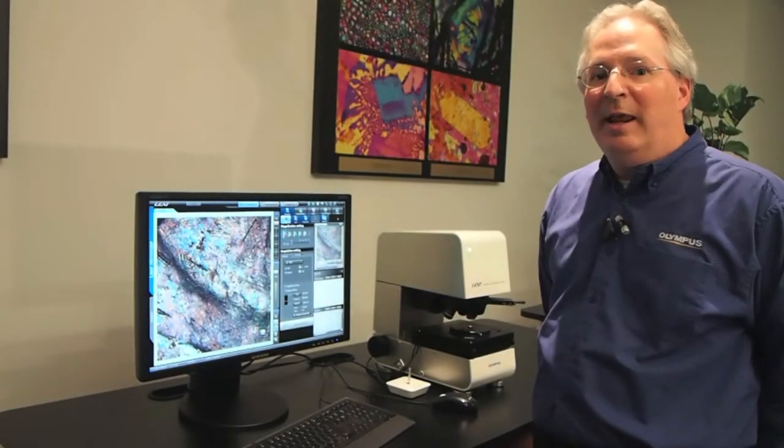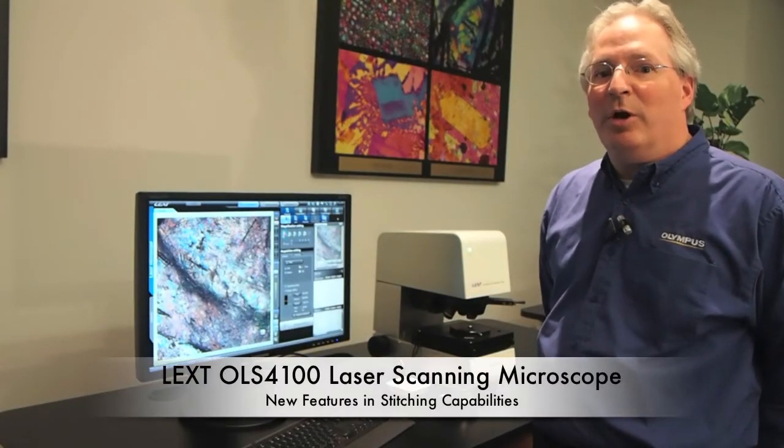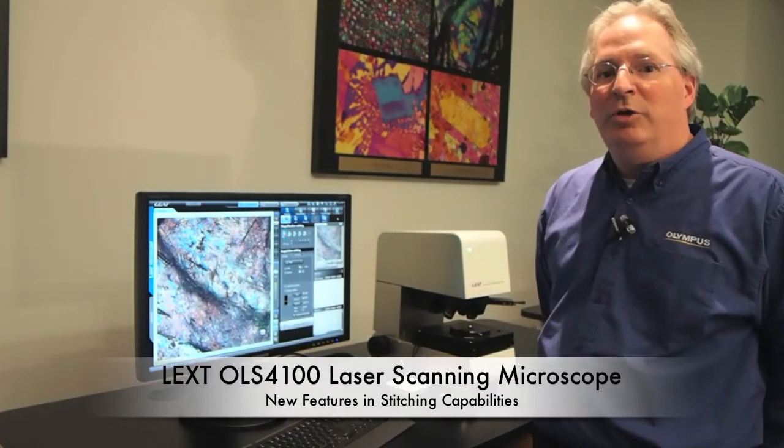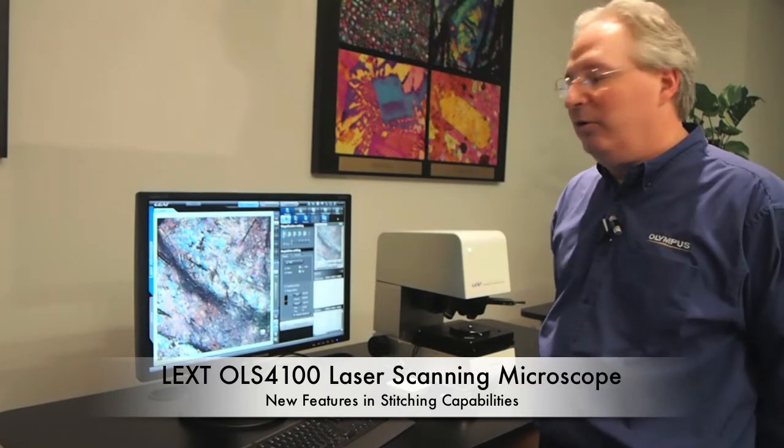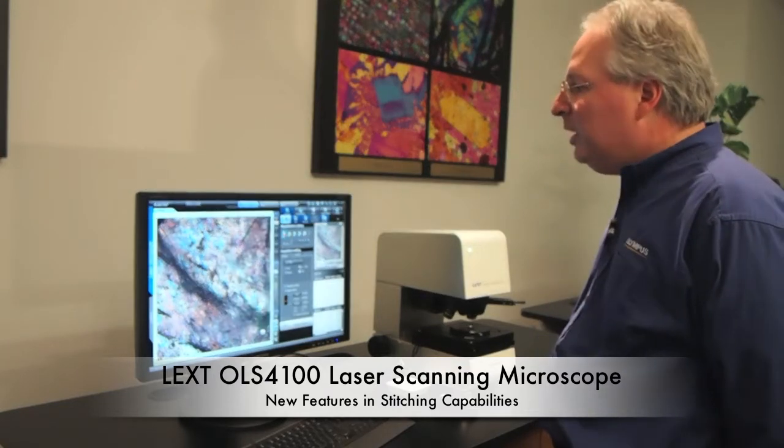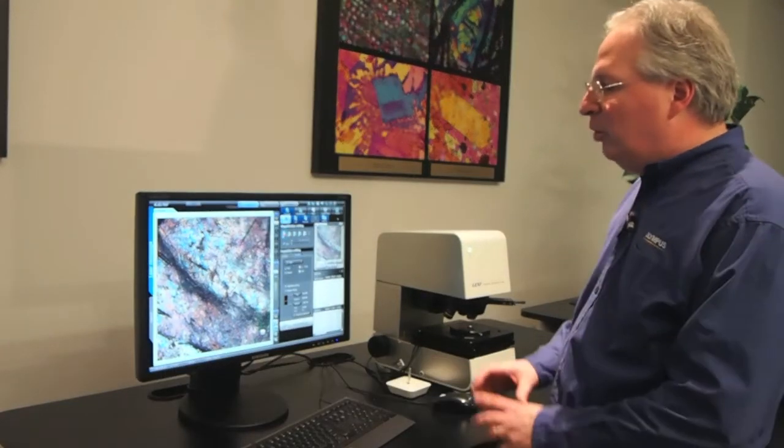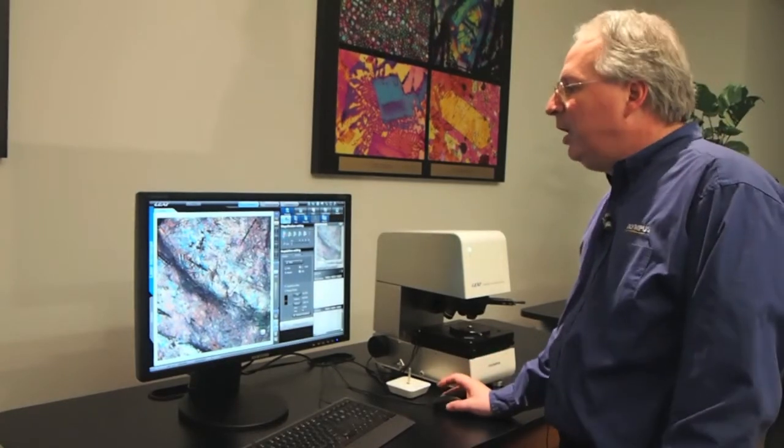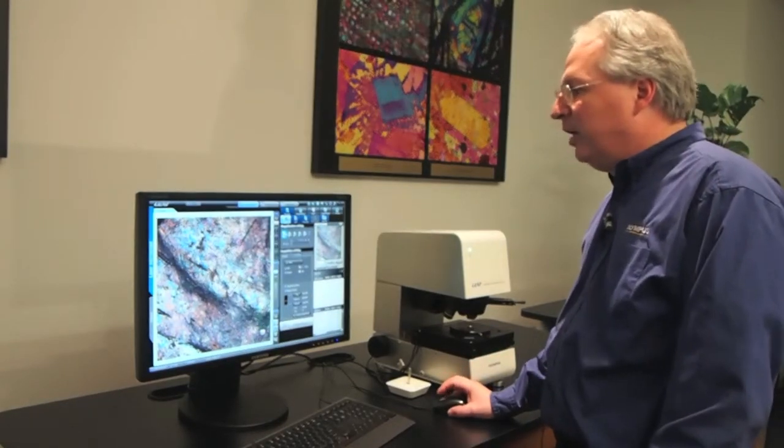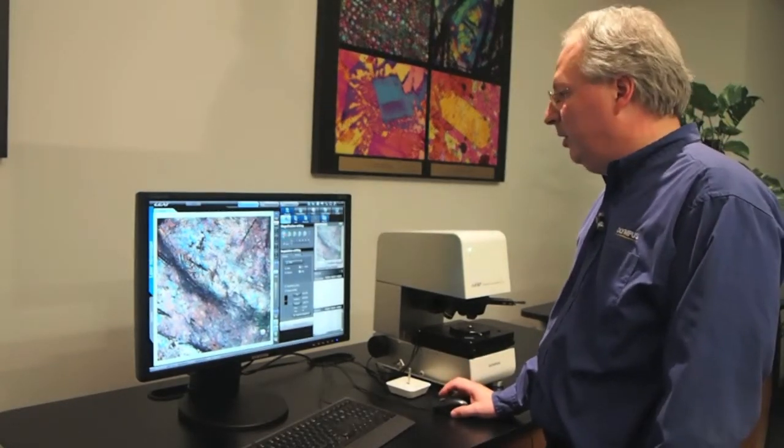I'd like to show you an enhanced feature on the OLS 4100, new features in our stitching capabilities. Looking at this sample, we can see only a small part. Even at our 5x objective, we're not seeing that entire image.